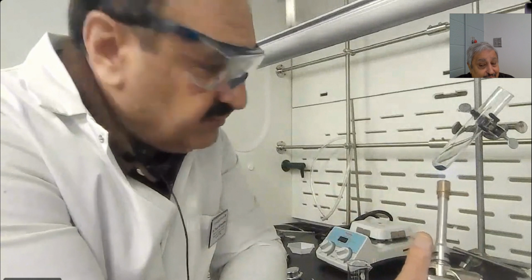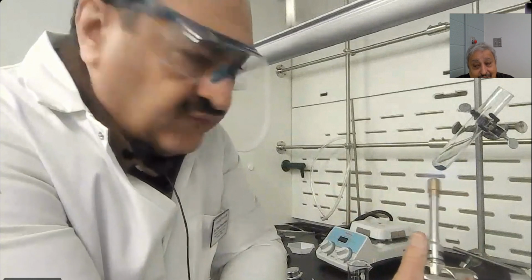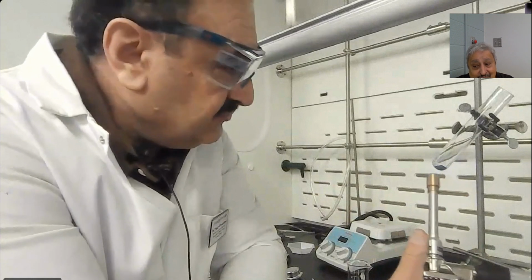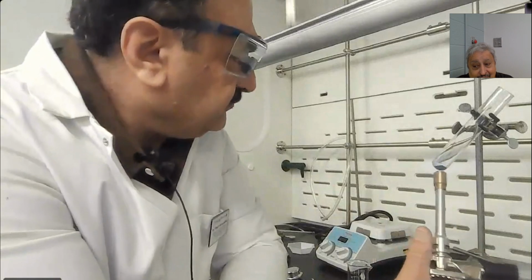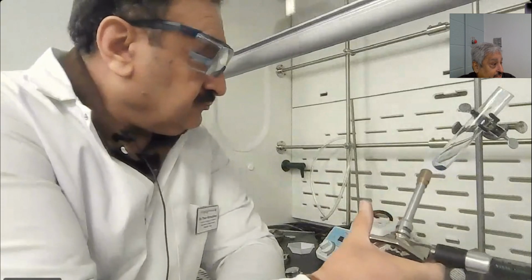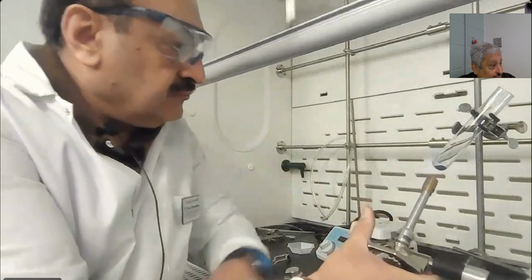I hope we'll finish this demo within 30 to 45 minutes without any issue. No, just 5 minutes, guys. Heating 5 minutes.